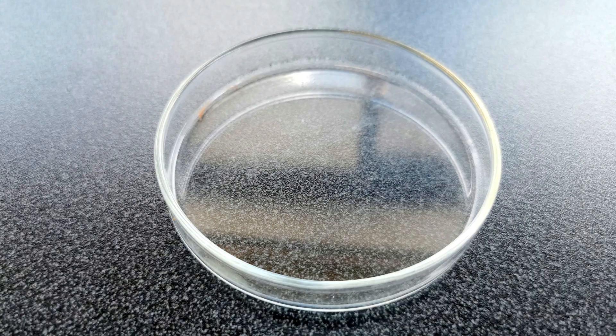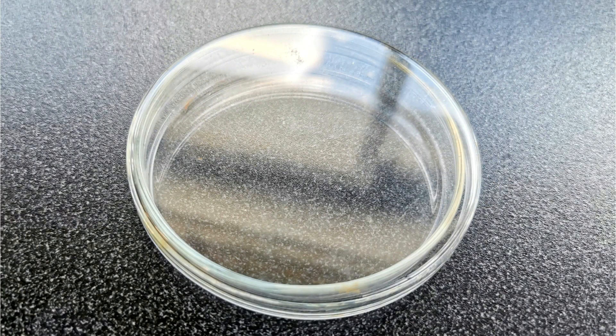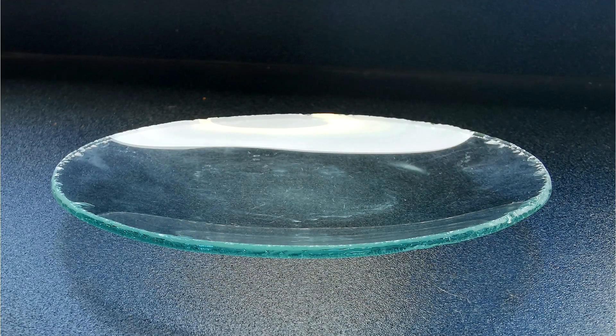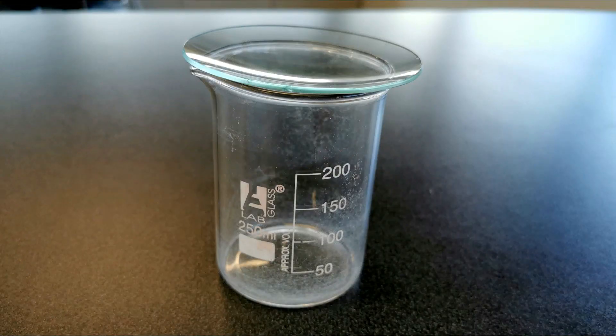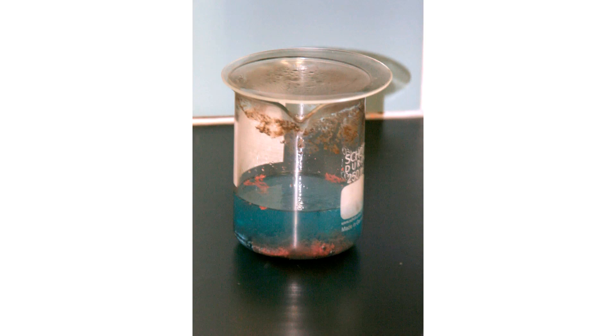Here's a petri dish — this is a glass petri dish with its lid on. You could put small specimens in your petri dish; they're often used to deliver agar jelly if you're looking at bacteria growth. This is a watch glass — it has a nice curved shape. You can put a bit of chemical on top of the watch glass, or put the watch glass on top of a beaker for evaporating. In this case we had copper dissolved in solution — that's why the solution is blue — with sulfuric acid, and put some zinc in, so the zinc displaces the copper out of solution, forming copper metal at the bottom of the beaker.